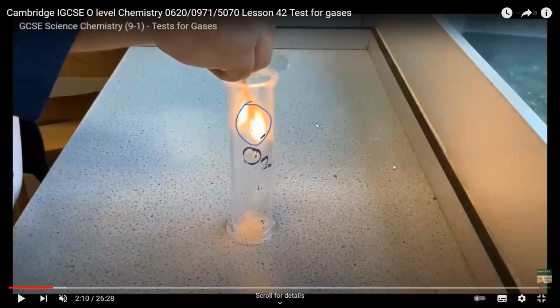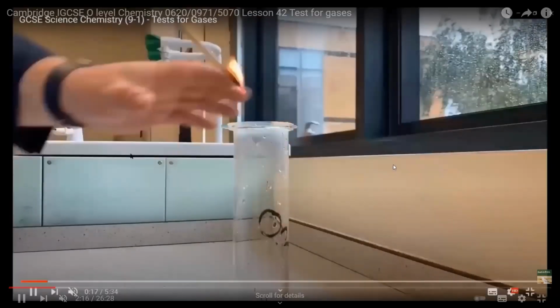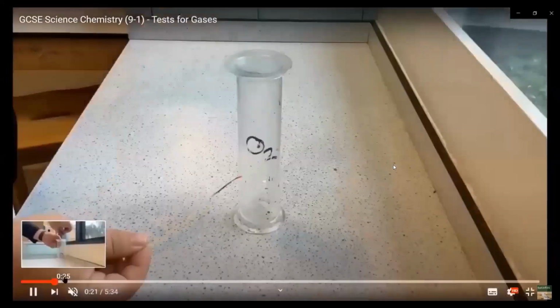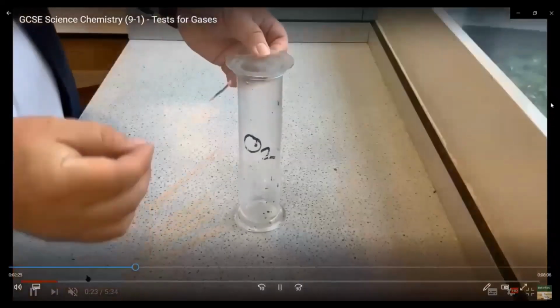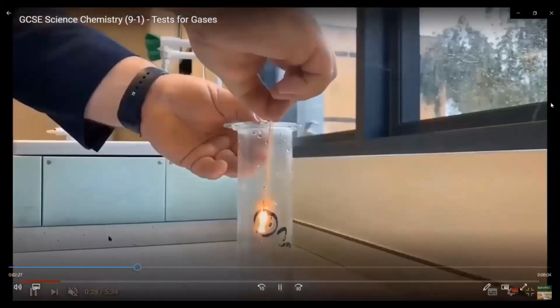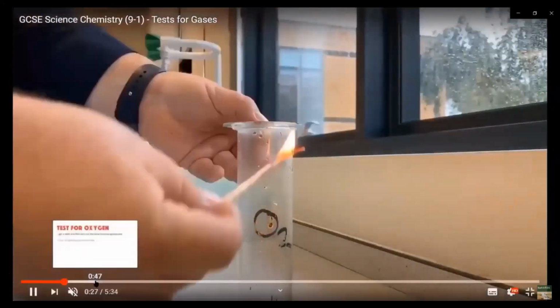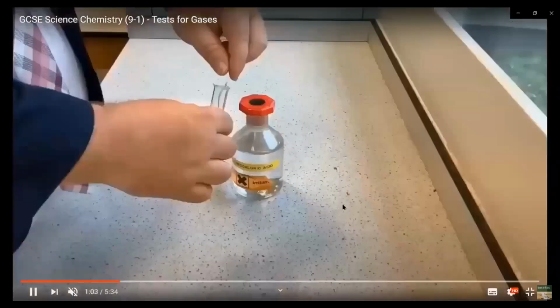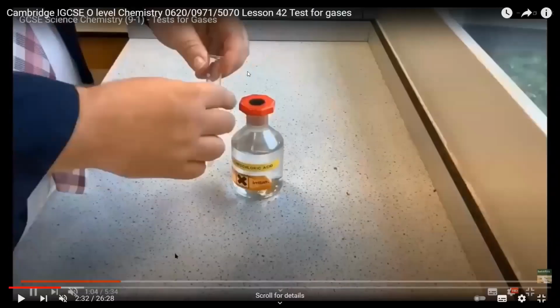You can see the glowing splint relights or bursts into flame, because oxygen supports burning. Oxygen helps in burning, that's why the glowing splint will relight.